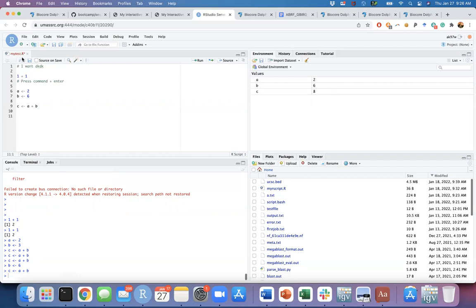You're going to see we are going to run these kinds of things a lot. So today we will do lots of computation: we're going to install libraries, use some functions in those libraries, and then finally you're going to start doing your differential expression analysis yourself here using RStudio.